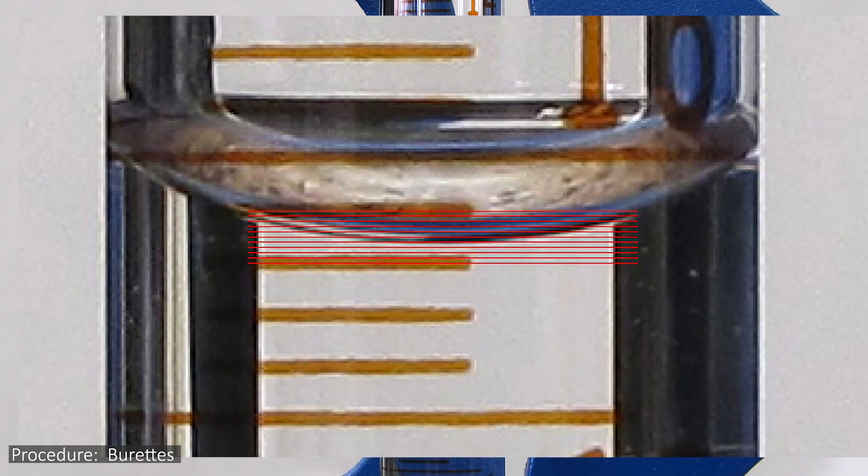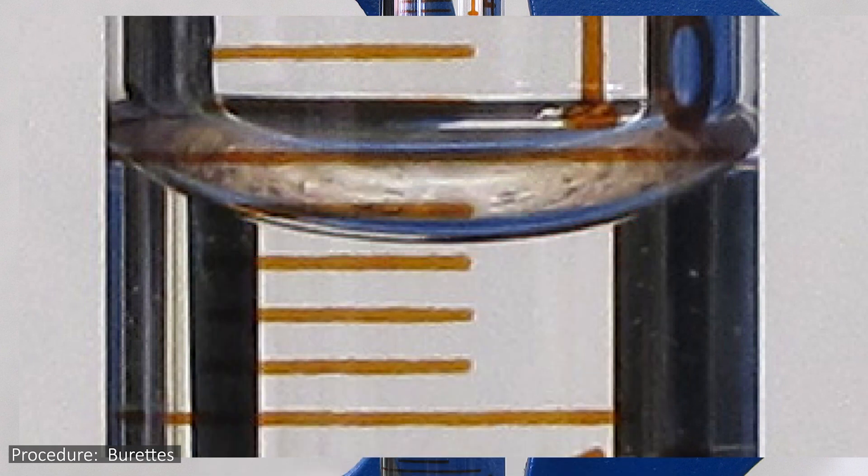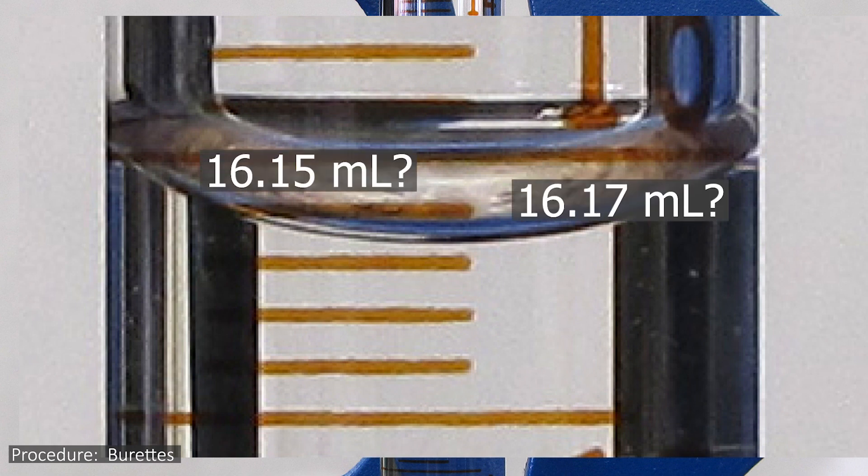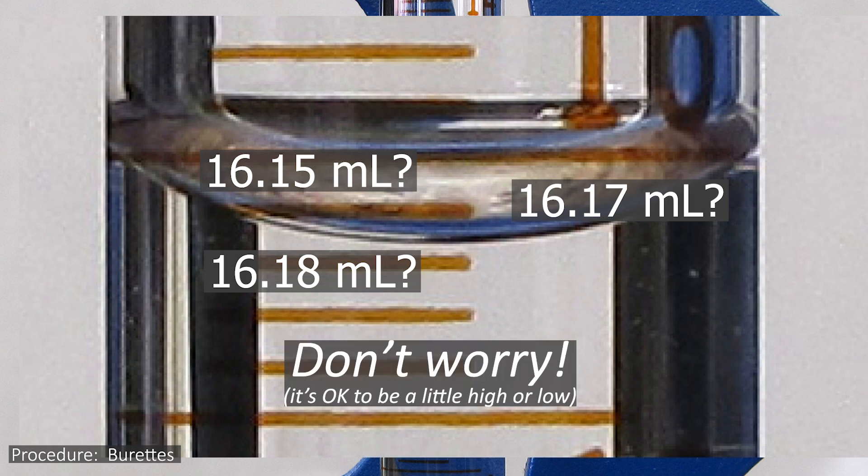Of course, when you go to do this yourself, you won't have any thin lines to help you out like the ones in this example, which does make it a little harder to figure out what that last digit is. Just estimate it as best you can, and don't worry too much whether your estimate is a little high or a little low. With some practice, you'll get good at this in no time.